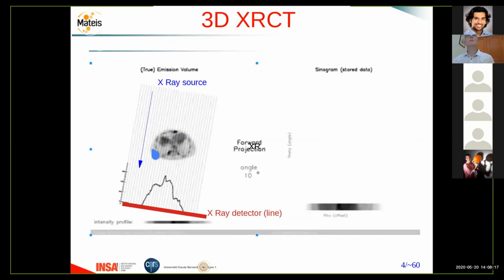So this here is the sample that you want to image. This is the microstructure of one slice of your sample, the slice which is in my screen now. You can also imagine that the sample is in 3 dimensions by thinking that you have similar slices above the screen and below the screen, okay? But if you understand what I explained to you for this slice, which is included in the screen, you will understand completely the method for a 3D case.